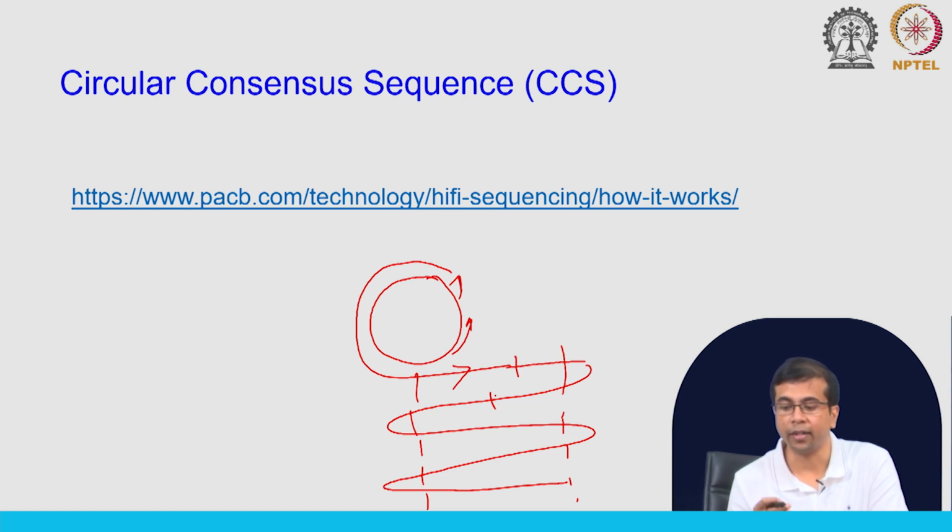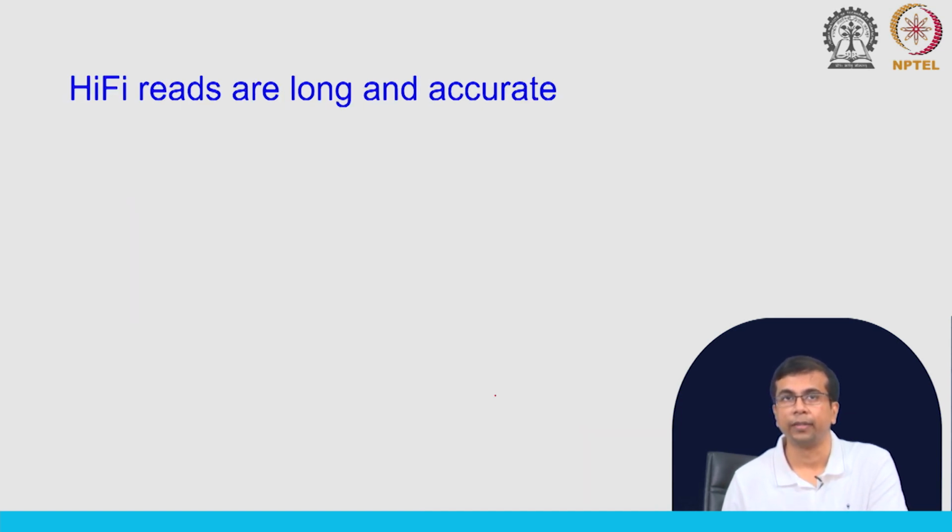Okay. Here is a link where you can see how this method works, and you will get a better idea of it through the animation. And the advantage is that hi-fi reads are long as well as accurate.